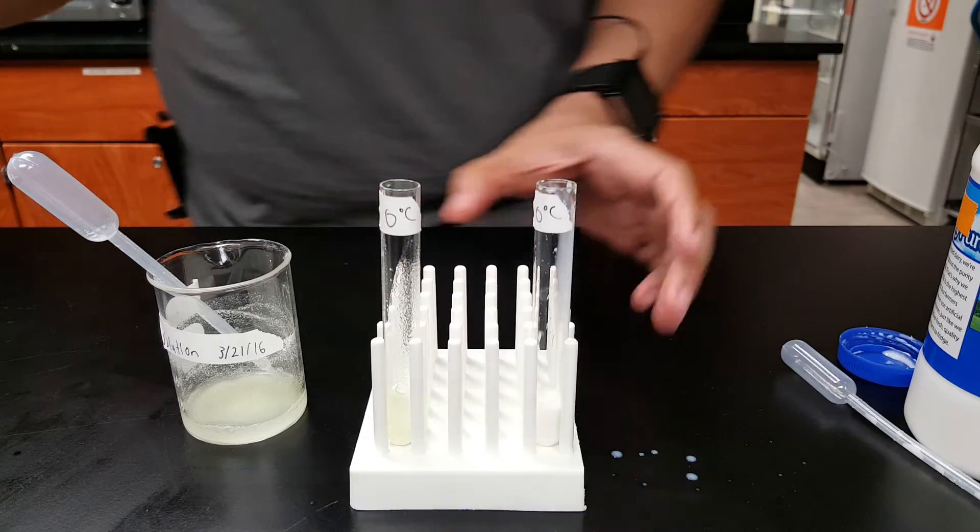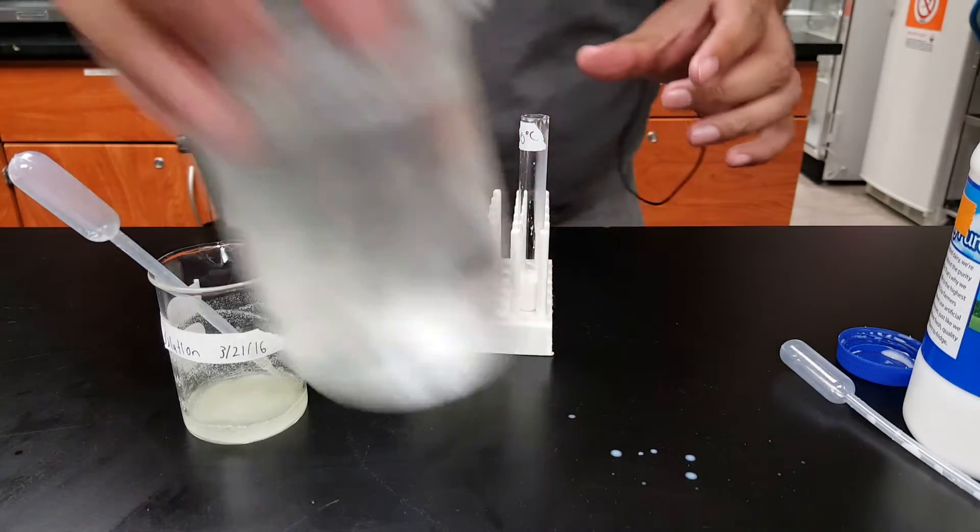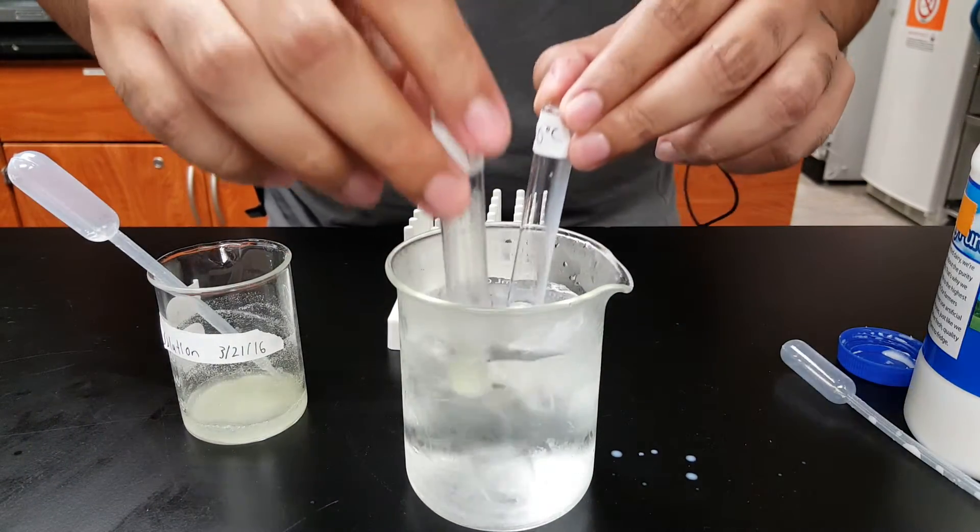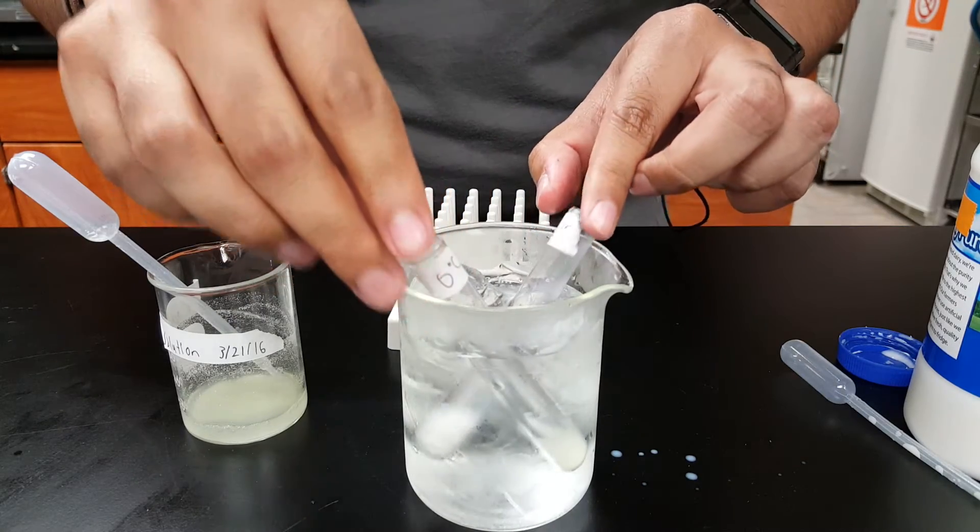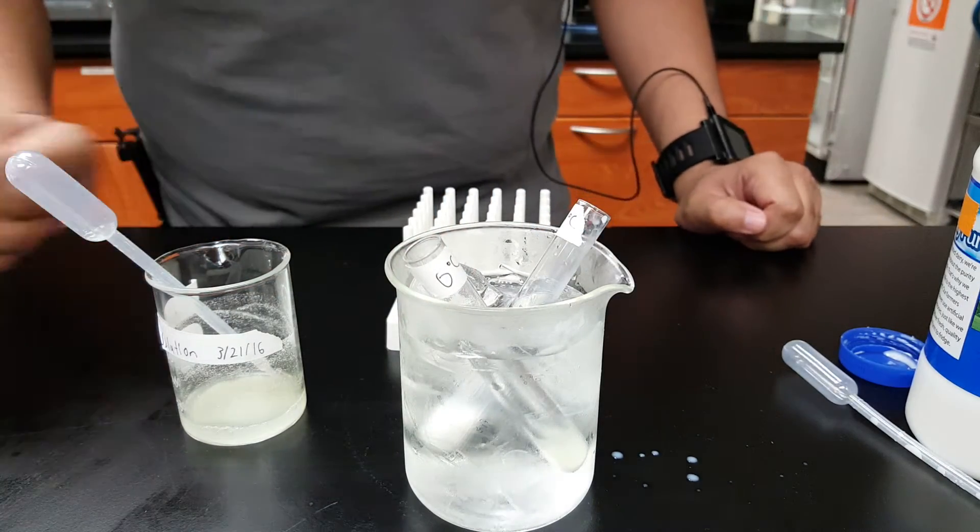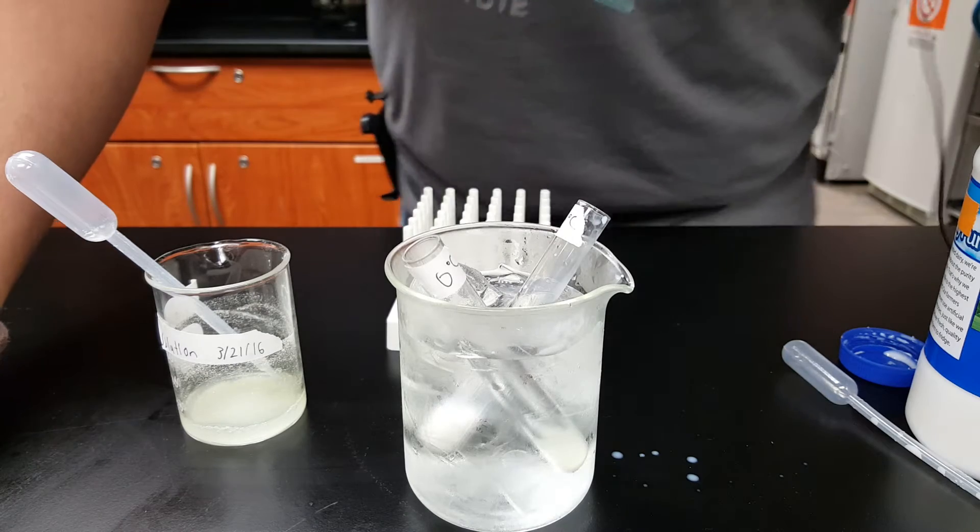Now you take both of the test tubes and put them in an ice bath to make sure they're nice and chilly. And then you leave them alone like that for about five minutes.